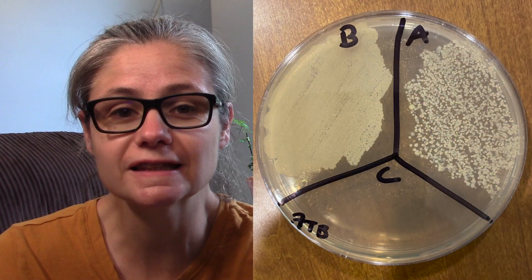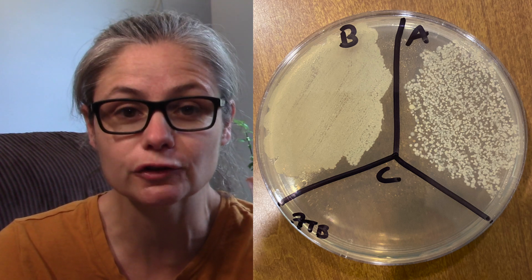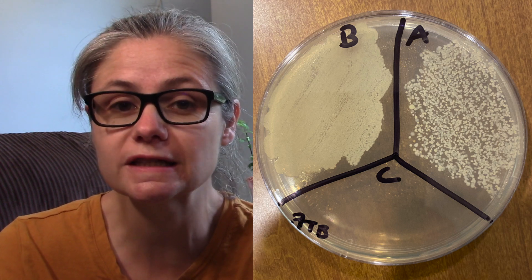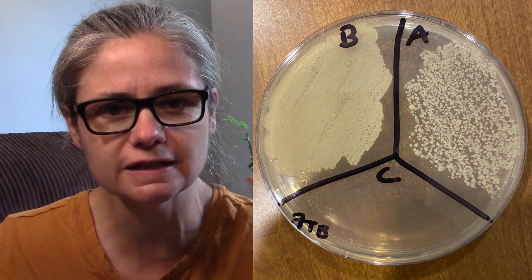Now for the results. We can see in the section labeled B for before there's a lot of bacteria — a big smearing of bacteria from our toilet bowl, which is to be expected. In our after section, we can see a clear decrease in bacteria. It doesn't get rid of a ton of bacteria, but there most certainly is a decrease.